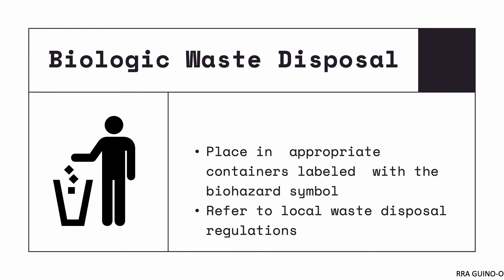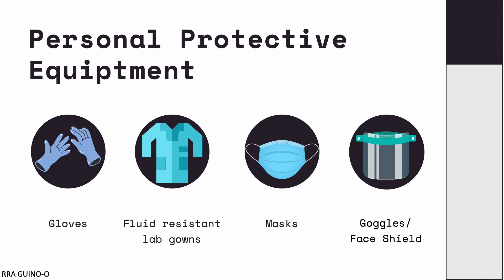For disposing of different biological waste, the first thing to do is place them in appropriate containers labeled with the biohazard symbol. After this, refer to local waste disposal regulations for safe disposal. Some agencies prefer that you incinerate waste on site, or you can outsource to companies that ensure biological hazards are safely disposed. Another way to protect ourselves from biological hazards is through the use of personal protective equipment or PPEs, including gloves, fluid-resistant lab gowns, masks, and sometimes goggles or face shields.